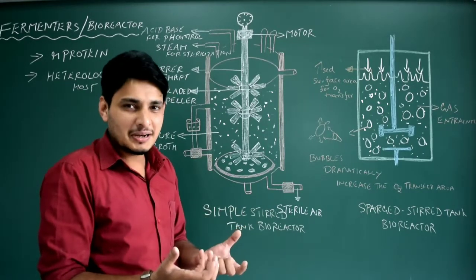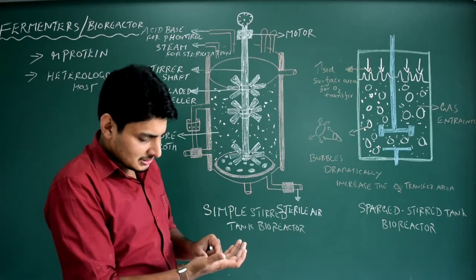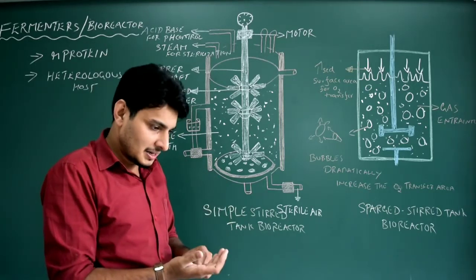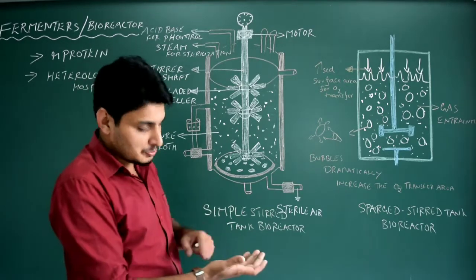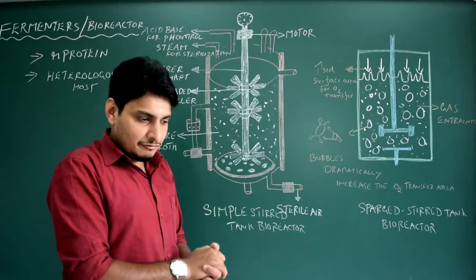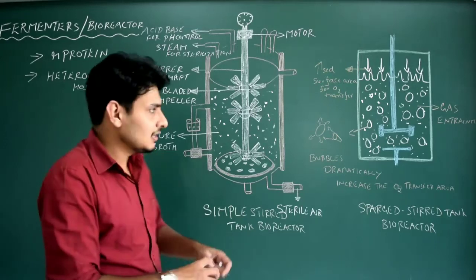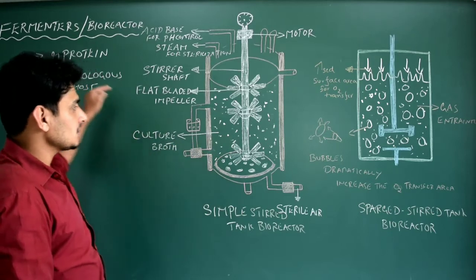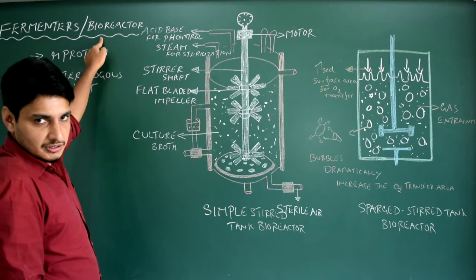Within a petri plate they cannot produce, because once the bacterial cells start dividing and increase in number, they ultimately reach the saturation point, because there is no space for further division, correct? It stops. But if I transfer these bacterial colonies containing our rDNA into large vessels, the name of the large vessels is fermenters or bioreactors. See the names.